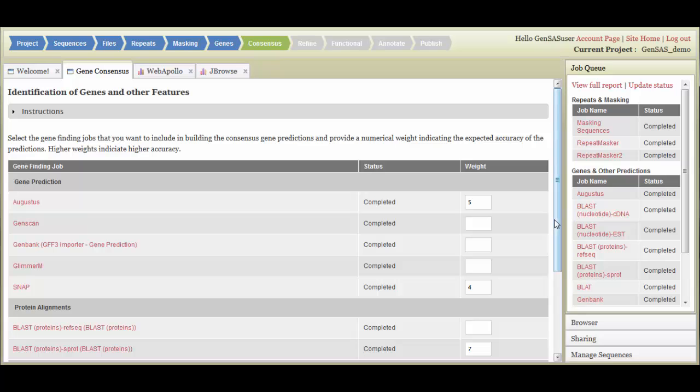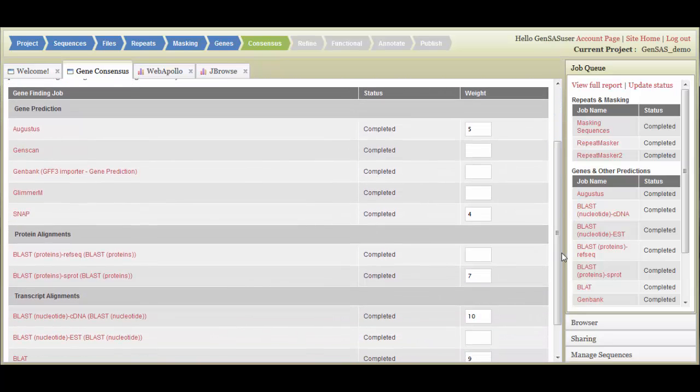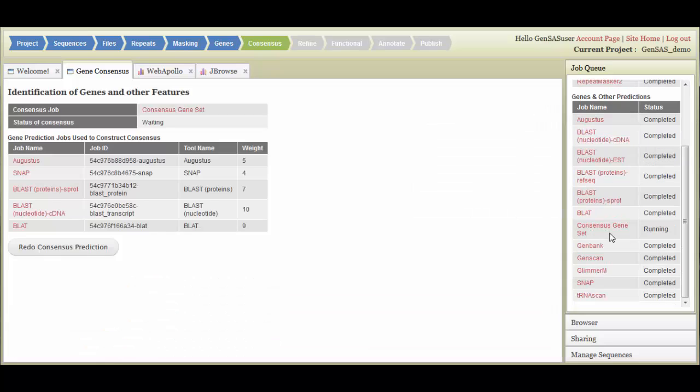Once you have entered the weights, click on the Create Consensus Prediction button. A consensus Gene Set job will appear in the job queue. You can also choose to skip this step by clicking on the Skip Consensus Prediction button. Once the consensus job is completed, you will be able to move on to the Annotate stage.